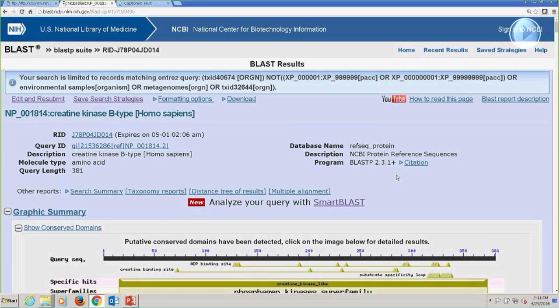There is another question about, is 5,000 the optimal value for protein, or does it depend on the size of the query sequences? No, you mean 5,000, it depends on what you're trying to do. The main thing is to make sure that that isn't limiting your results, that the expect value cutoff is limiting your results.